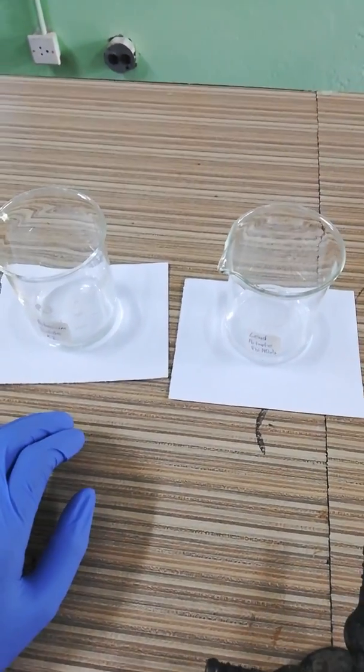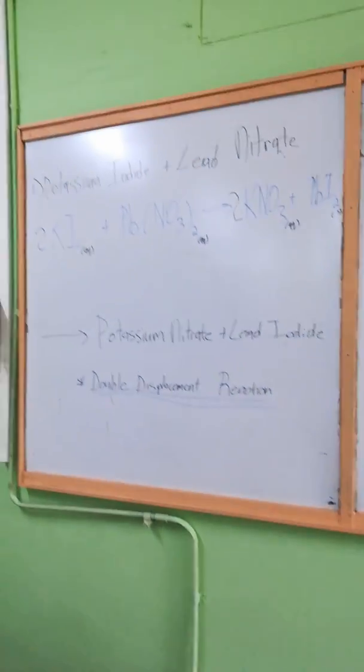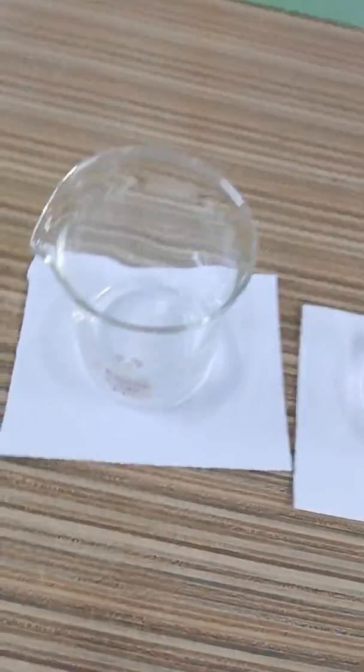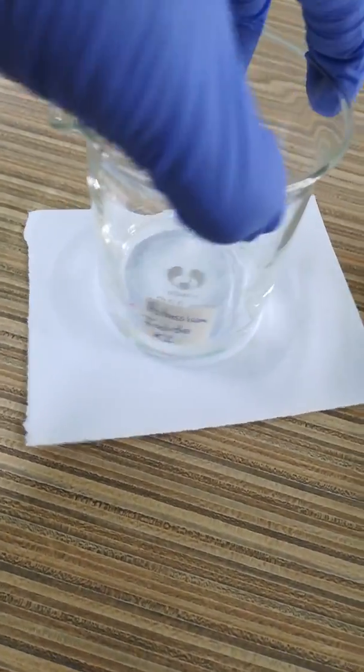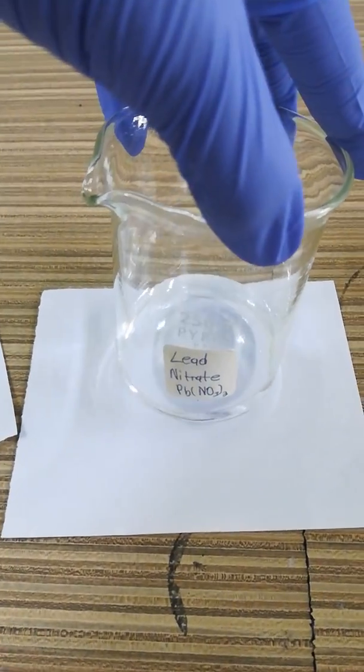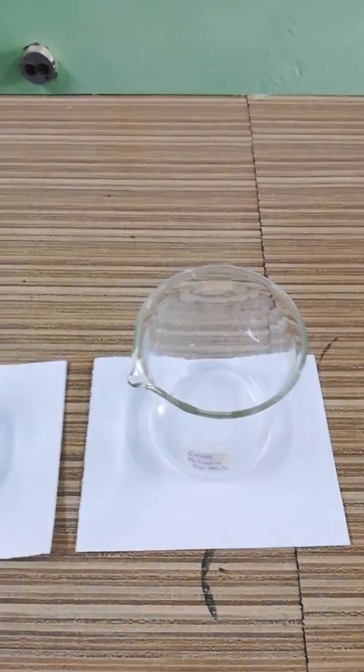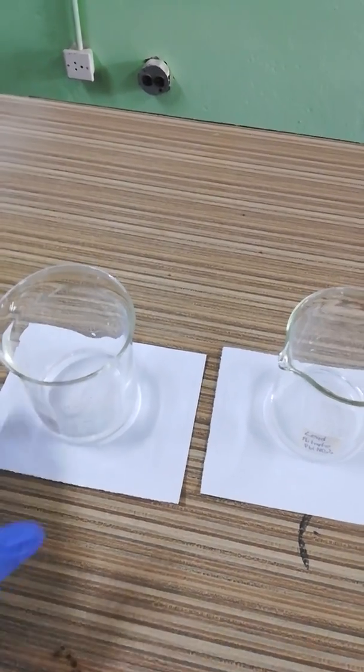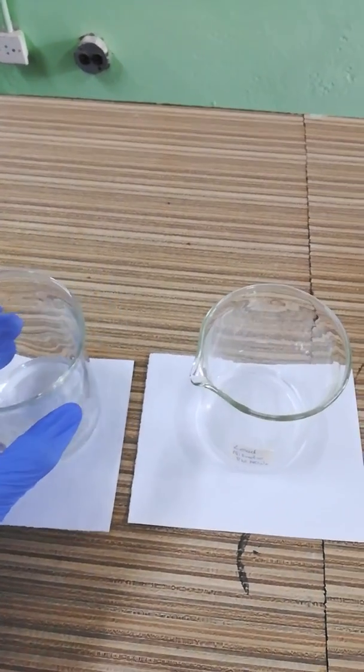The first experiment that I'll be doing is a reaction between potassium iodide and lead nitrate. As you can see here, potassium iodide and lead nitrate are both colorless liquids, but when I mix them there should be a color change.